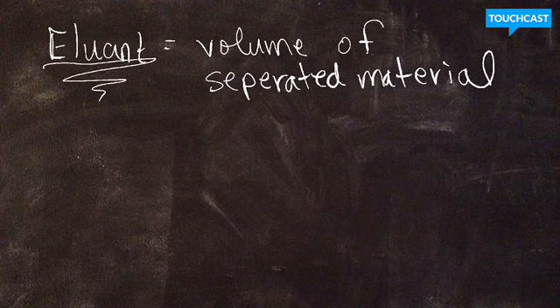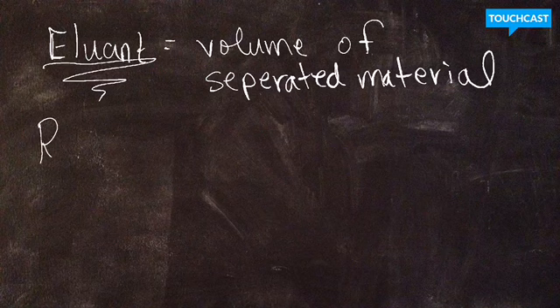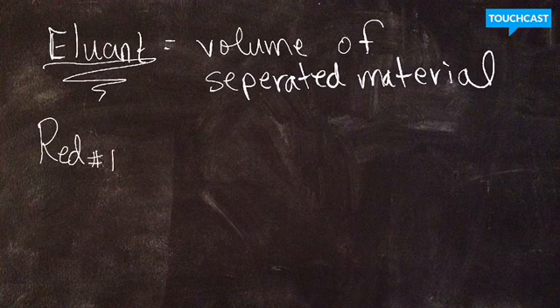All right. So when you look at the red dye data table that they gave you, make sure you have your lab in front of you. You did the red dye 3 different times, in 3 different runs. So for red, trial number 1, we're going to look at the bandwidth. All of this math that you're doing on this pre-lab is basically math that symbolizes how effectively you separated the dyes. So keep that in the back of your mind when you wonder what we are doing: we are mathematically determining the effectiveness of the separation.